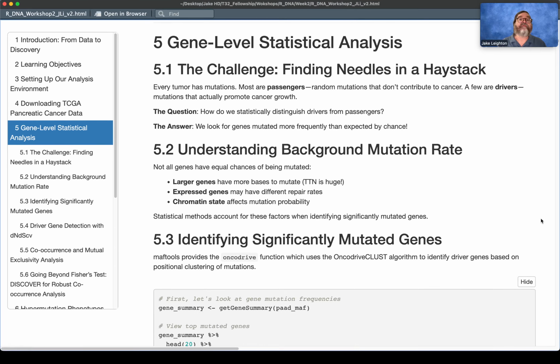That is great. So the first thing we want to do is look at mutations in every tumor that are occurring at a higher frequency or are above chance, right? So every tumor has mutations, tons and tons of mutations, but most are actually just germline or they're passengers. They're just random mutations. They didn't really contribute to anything. They're just there, caused by the pressures of the environment or life. But for whatever reason, they don't cause problems downstream, so they're just hanging on for the ride, right?